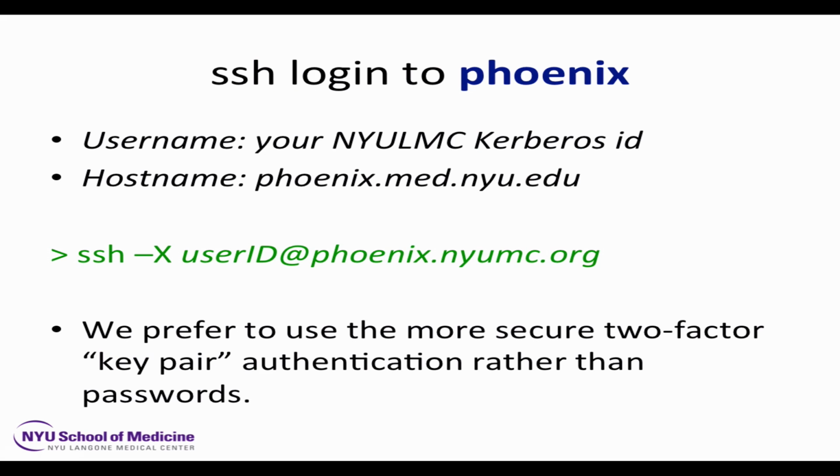All right, so you could do this now so that we're all ready to go when I start showing the examples. You want to log in to Phoenix. We're using this key pair authentication, which Eric and Ali have already taken you through. Let's go. Do it. Log in.